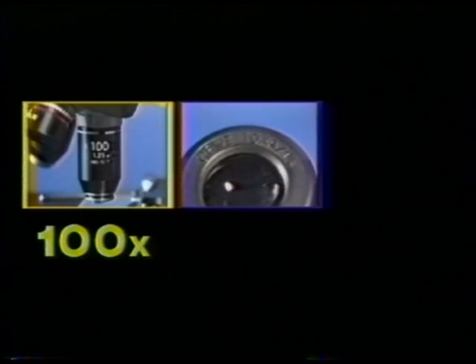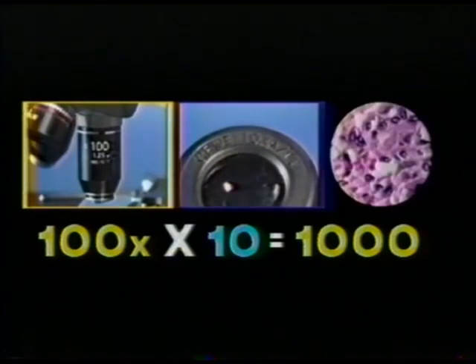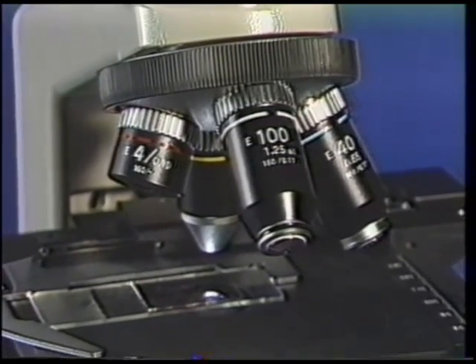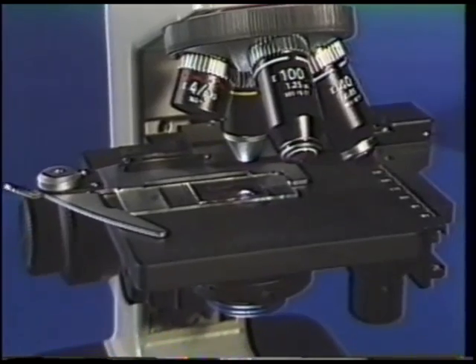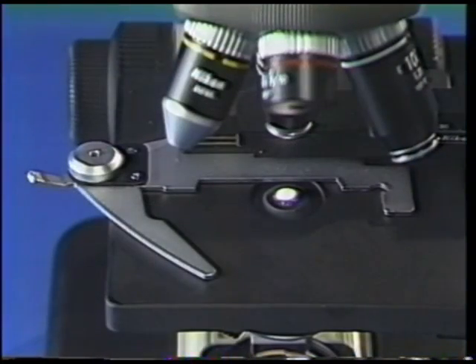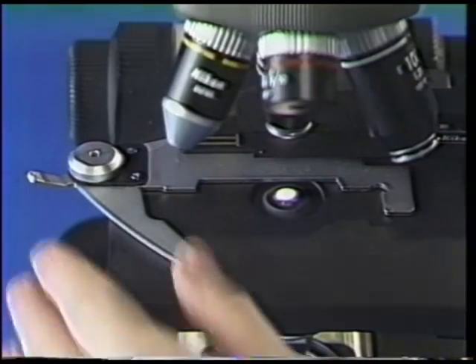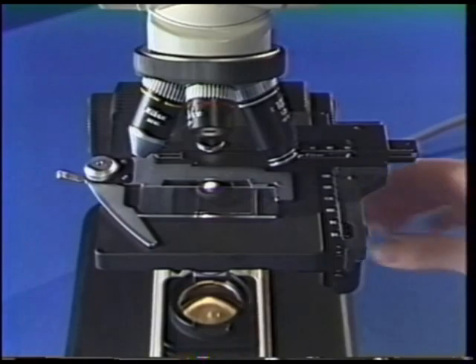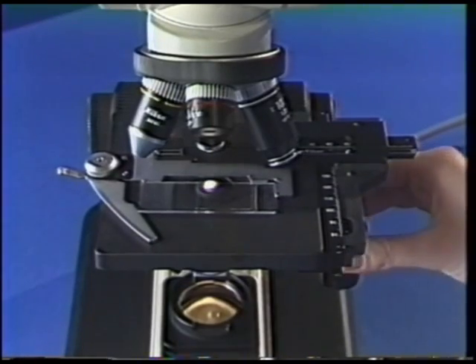Total magnification of your specimen image is obtained by multiplying the objective magnification times the eyepiece magnification. Below the objectives is our third region, the microscope specimen stage. A slide holder is attached to the stage to secure the specimen in place. Once secured, the specimen can be moved with the X and Y travel knobs below the stage.